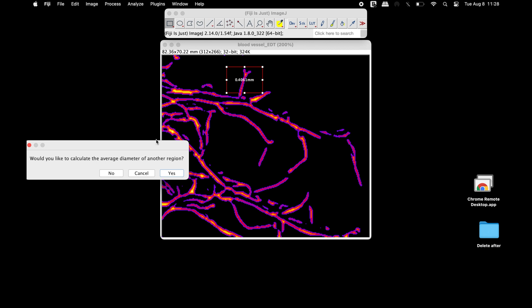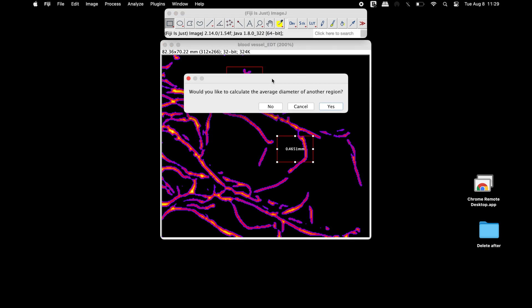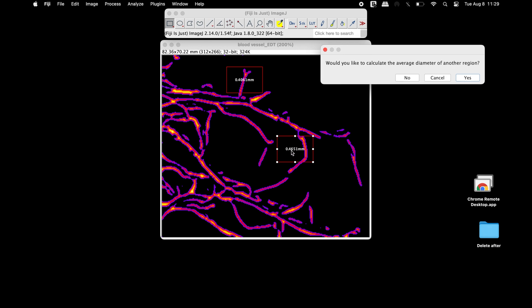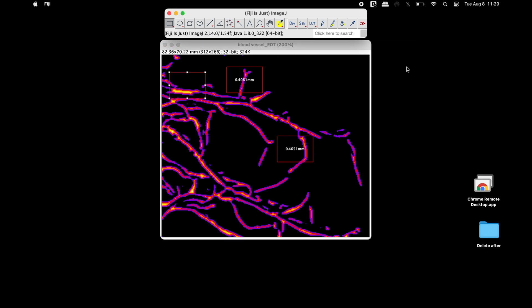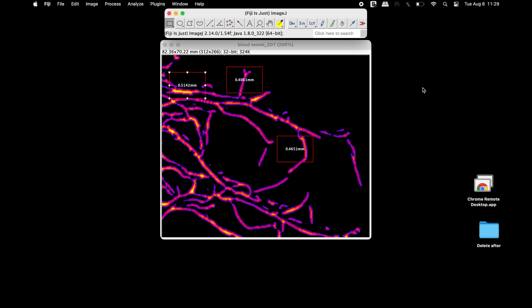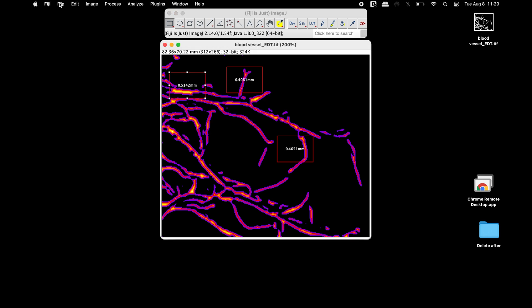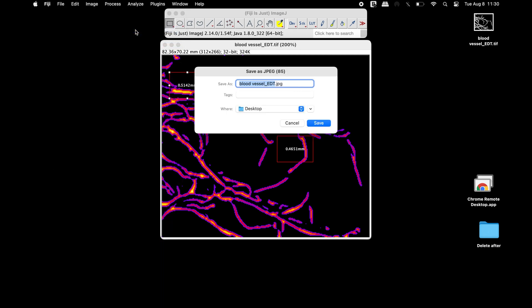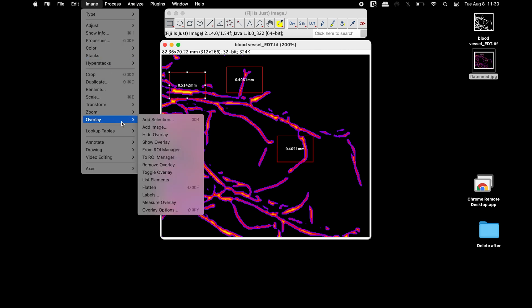To measure the vessel diameter of another segment, click Yes and select the region of interest. Once selected, click OK. Users can continue measuring the average diameter of additional blood vessels. To end the measurement process, click No, then click Save to save the results. The flattened image can also be saved: click File > Save As, select JPEG, rename the file, and save. To remove overlays from the image, click Image > Overlay > Remove Overlay.